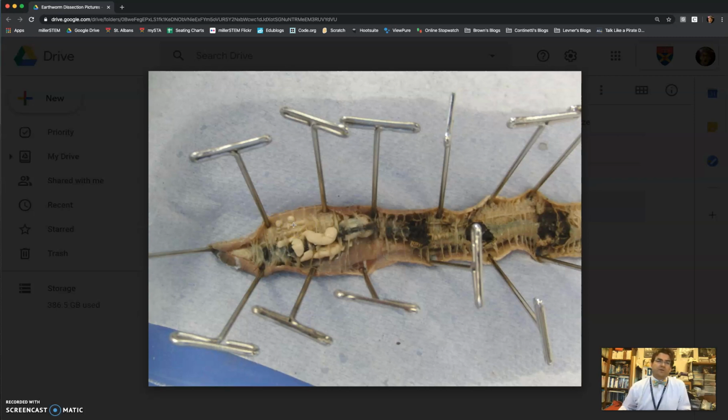And then the last two things that are on the list to be able to identify, here is an aortic arch, which we said before is the heart. So you have the aortic arches, and then we also have the clitellum. And again, you can see the clitellum is down here. You follow the skin color, and right there, it changes skin color, and that is where the clitellum is located here on the worm, and then it goes back to just the regular worm skin.